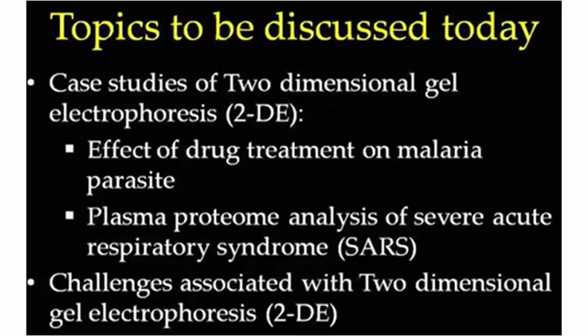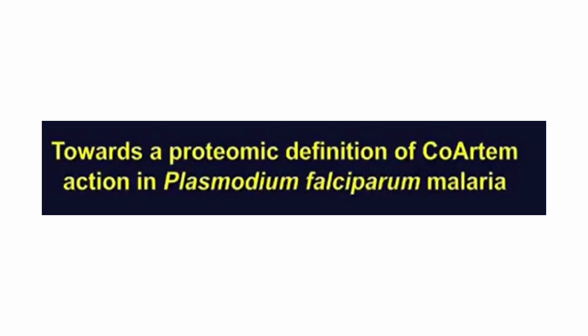Then, in the final lecture, the fifth lecture, sir gave few more case study examples, like effect of drug treatment on malarial parasite, and the plasma proteome analysis of SARS disease, like COVID. And sir also talked about certain challenges with two-dimensional electrophoresis.